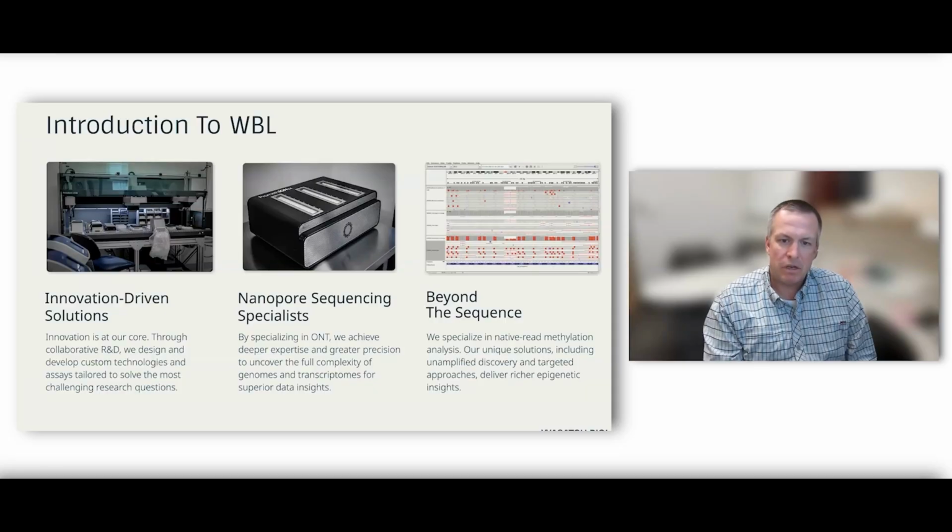Our lab focuses on Oxford Nanopore sequencing. We specialize in it, and I think have gotten quite good at utilizing all of its potential in methylation sequencing in particular. One of the reasons that we focused on Oxford Nanopore technology, as was nicely outlined by Alex earlier, is that we get more information than just the sequence itself.